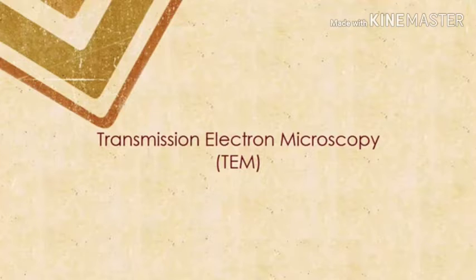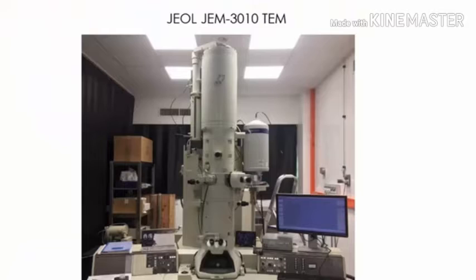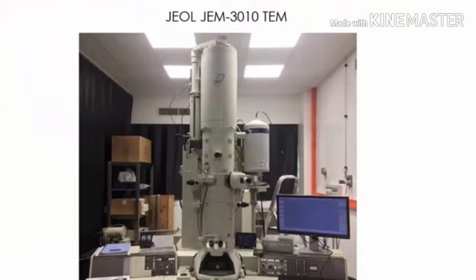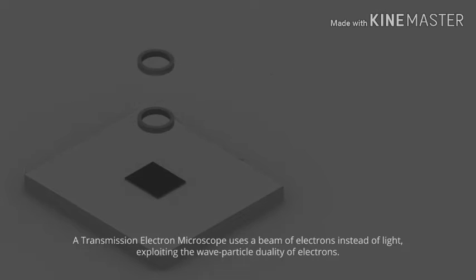Transmission electron microscopy is a microscopy technique where an electron beam transmits through an ultra-thin specimen and a nanometer-scale shadow image is taken. This is an example of a transmission electron microscope. The transmission electron microscope uses a beam of electrons instead of light, exploiting the wave-particle duality of electrons.